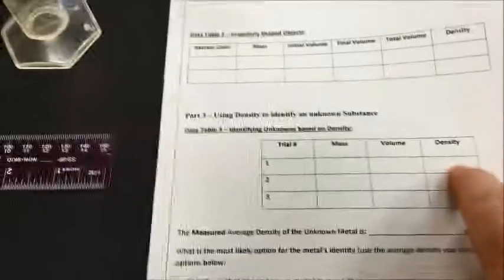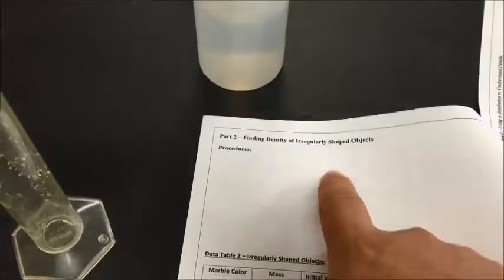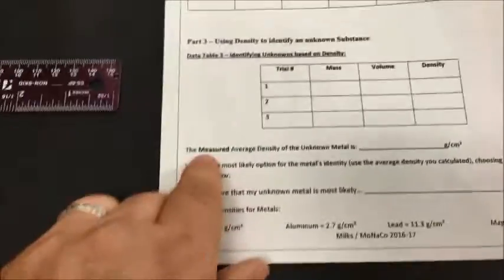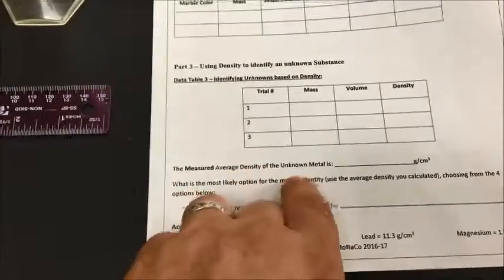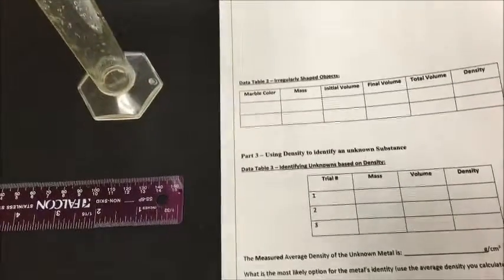You'll calculate the density in the same way. Mass divided by volume. You'll find this volume by doing the irregularly shaped object technique. Okay? And then you will have a measured average density of the unknown metal. Measured average means I need you to do it 3 times. 1, 2, 3. Not everybody's accurate the first time, second time.